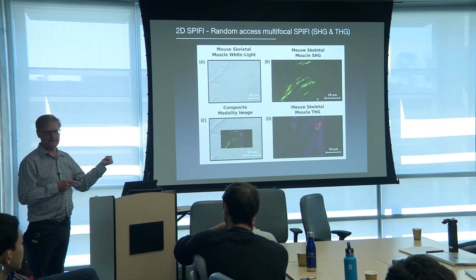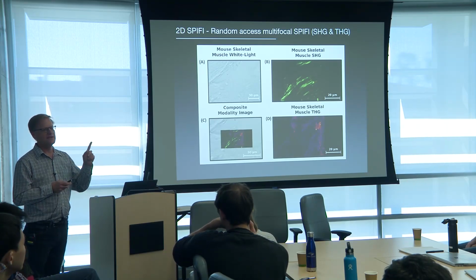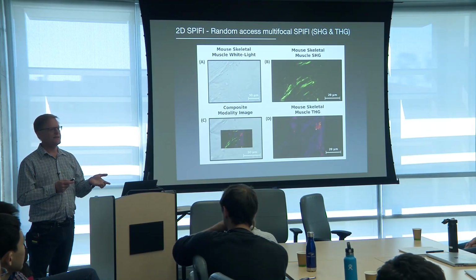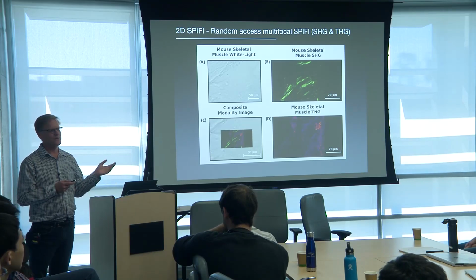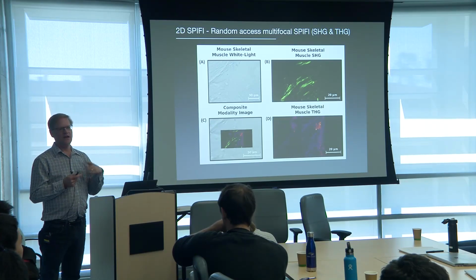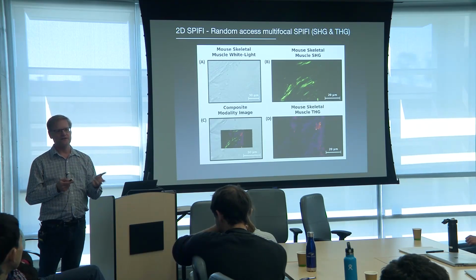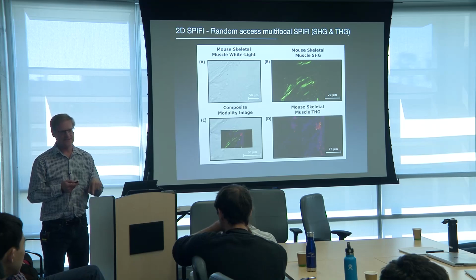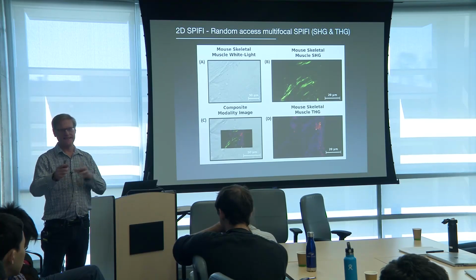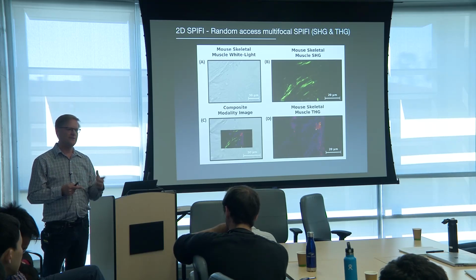Yeah. So it actually leads in nicely to what we'll do next. But to be honest, right now we're just kind of saying that because we haven't done a lot of dynamics yet. So the idea is that if you make simple arguments based on the fact that we've got n sources simultaneously, our pixel dwell time does increase, so we should see an increase in signal to noise due to that. But we also see a decrease in the signal to noise in photomultipliers because you are detecting n simultaneously, and that gets noisier from that perspective. But if you weigh those two against one another, we still think we win.